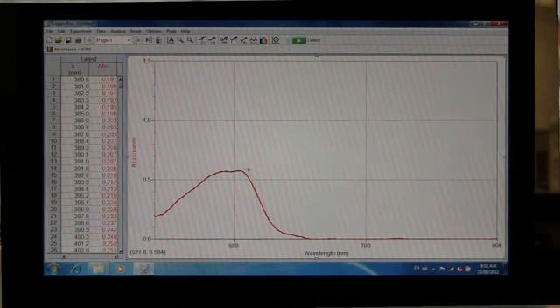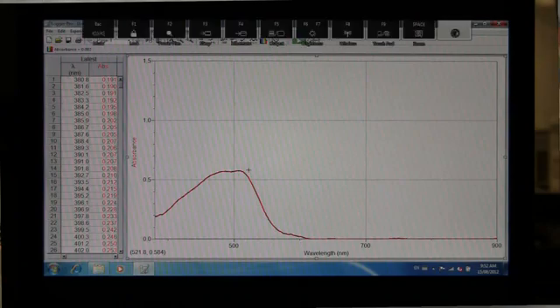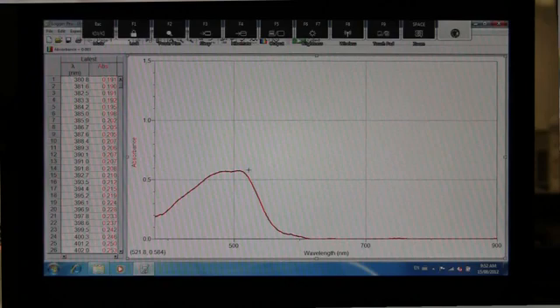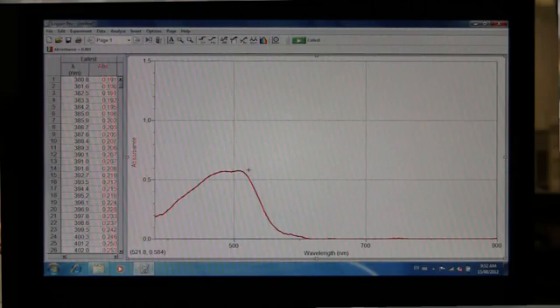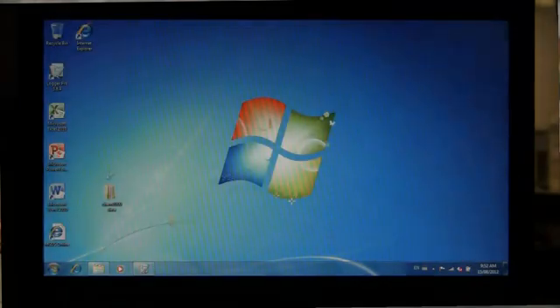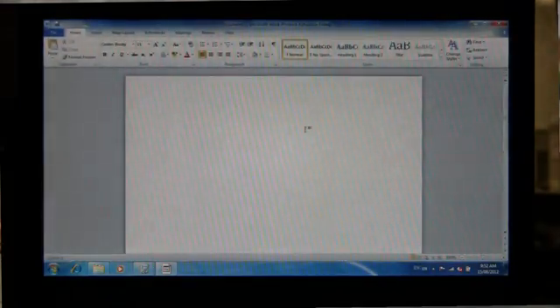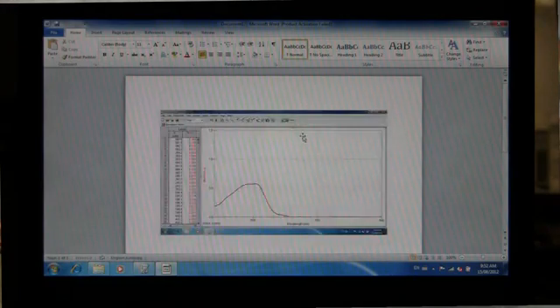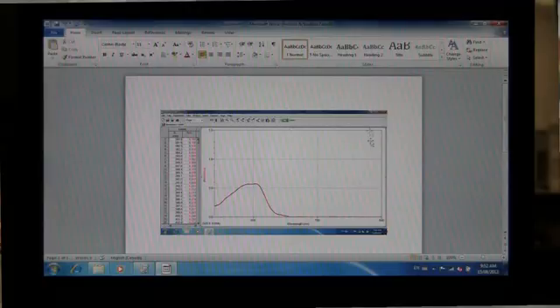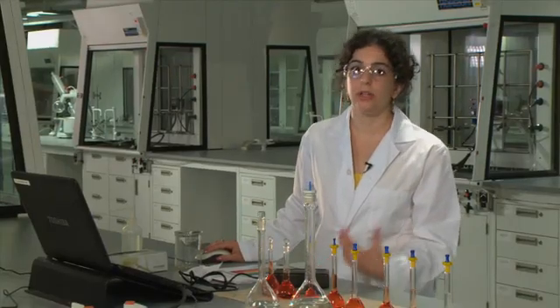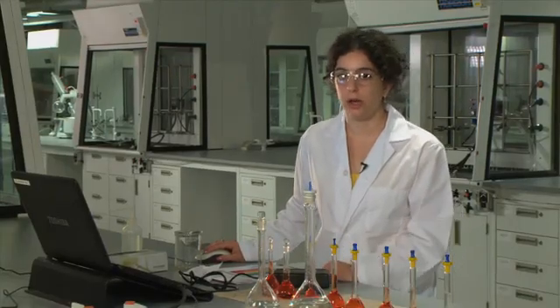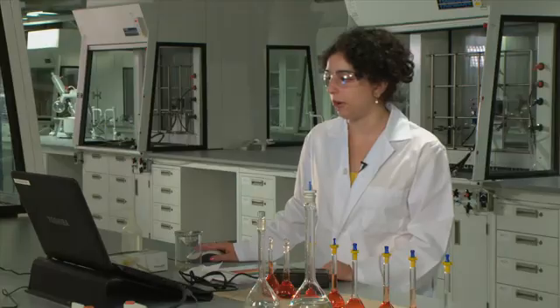So you'll want to save this spectra in a Word document for your lab report. And to do that, on your keyboard, you can hit Function Print Screen. And open it up, and open up a Word document and paste the object in Word. And save the file so that you can print it off later on.